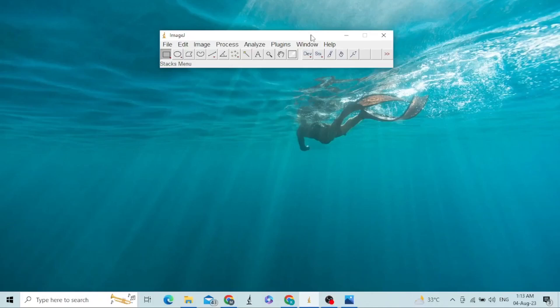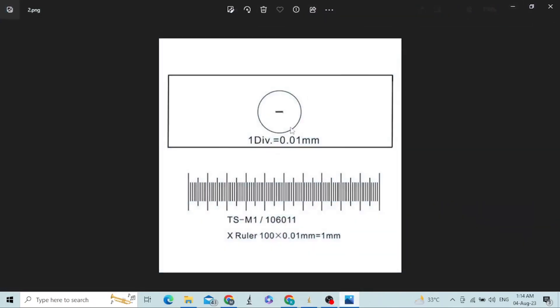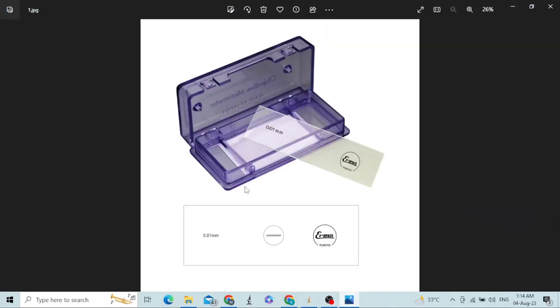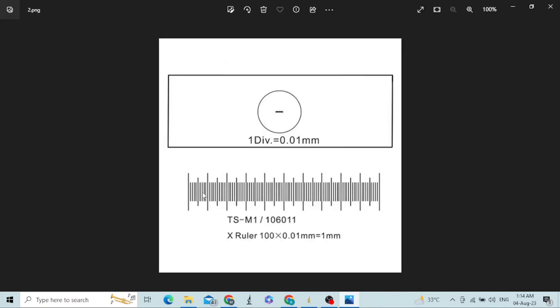Today we will see how ImageJ is calibrated. ImageJ is calibrated with the help of a stage micrometer. Here is a picture of a stage micrometer — it is a glass slide with a circle in the center, and inside the circle there is a line. This line has 100 divisions, and each division is 0.01 millimeter.